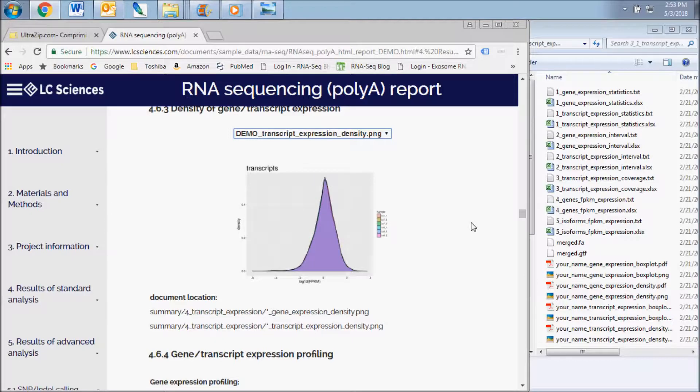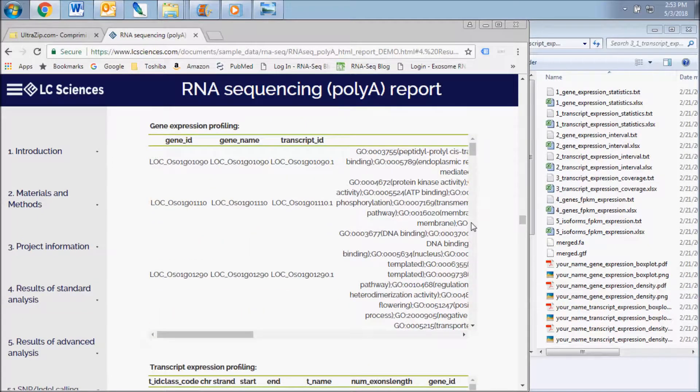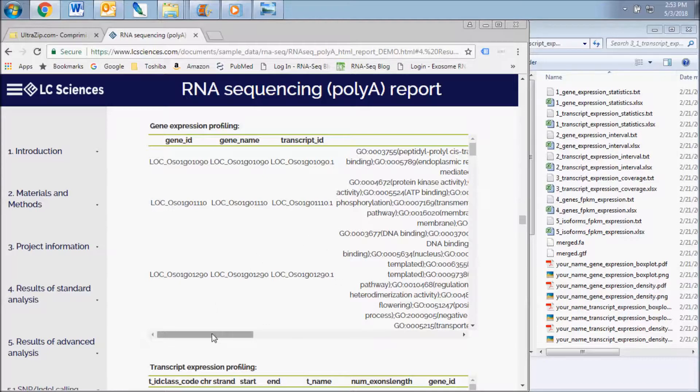The next two charts, Gene and Transcript Expression Profiling, present the FPKM expression values for each individual gene and transcript sequenced for each sample.